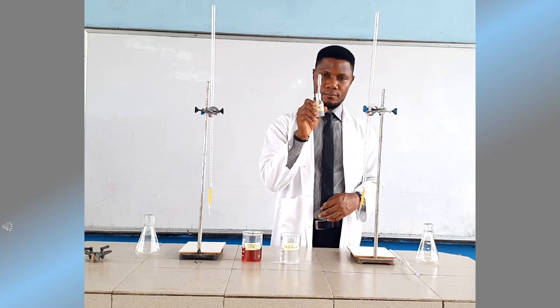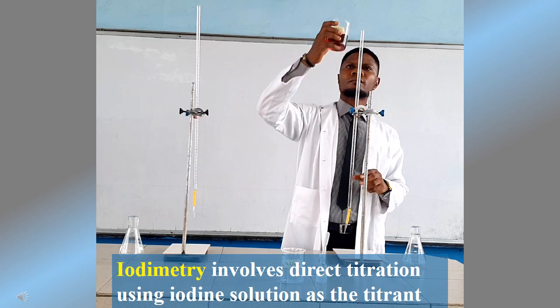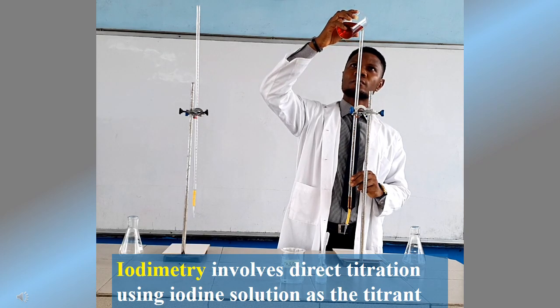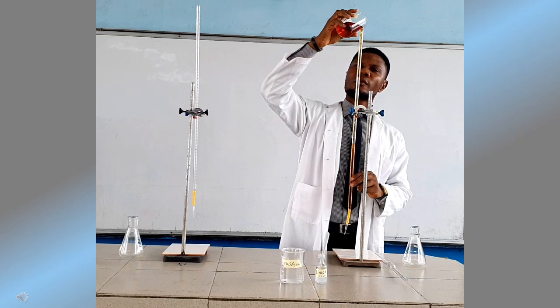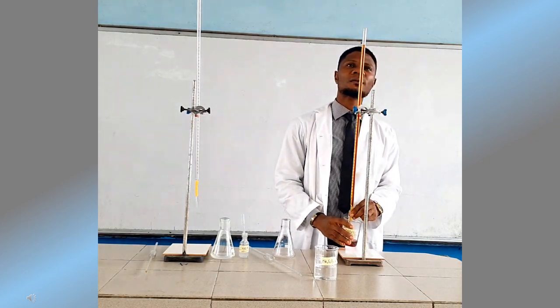Now let us proceed to Iodimetry. Iodimetry involves direct titration using iodine solution as the titrant. What does that mean? It means that the iodine solution is filled into the burette. Just as we could see right now, the iodine solution is being filled into the burette.